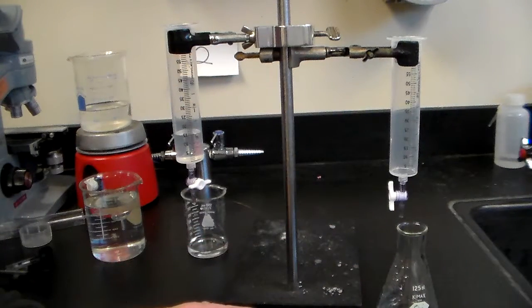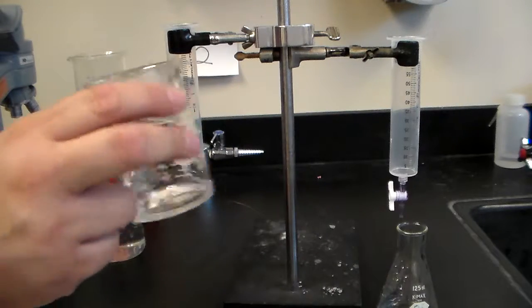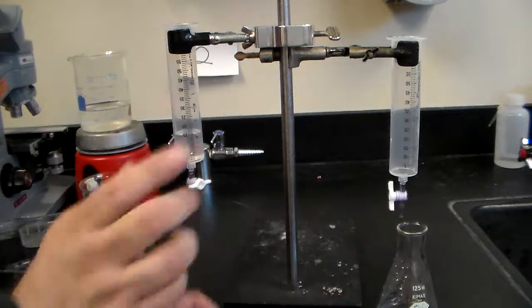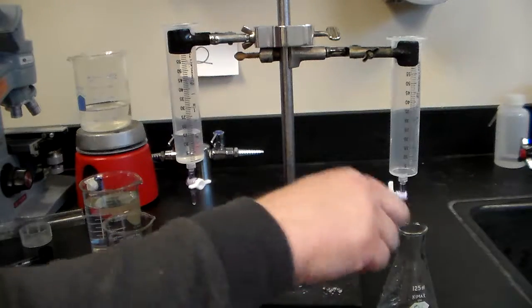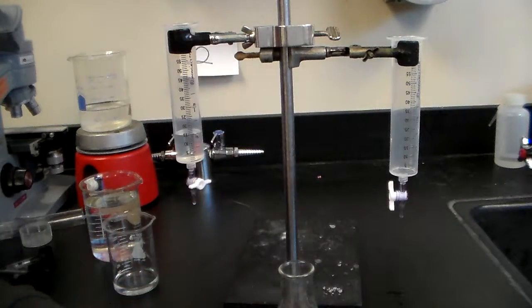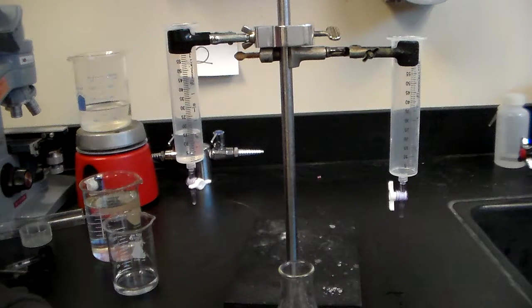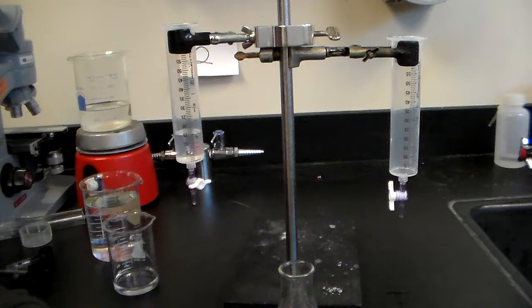Then you can rinse that out, dump that into the waste beaker, and you can take your squeeze bottle and rinse this out with distilled water. Then you're ready to start the whole thing all over again. That's the basic idea behind titration. You're taking a concentration that you know what it is.